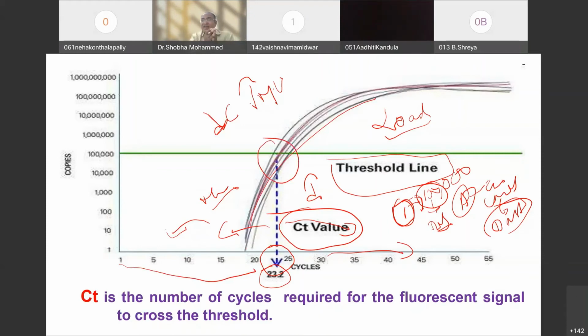So it's a big story to explain to you in the molecular techniques. You need not worry about that. The standards which have been supplied with that particular kit will allow me to fix one particular point that, okay, at the cycles it has been lesser than this, will identify. If I have more virus, it will identify at the lower number. If I have a less virus, it is diluted. I have given an example with the 100 COVID molecules. Then I have given an example with the 1 lakh or 100,000 with that. So the dilution is a very important factor in the sample what is being collected in the form of a buffer. Got the point here?